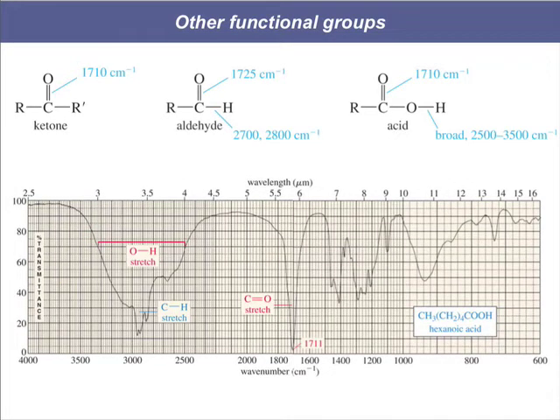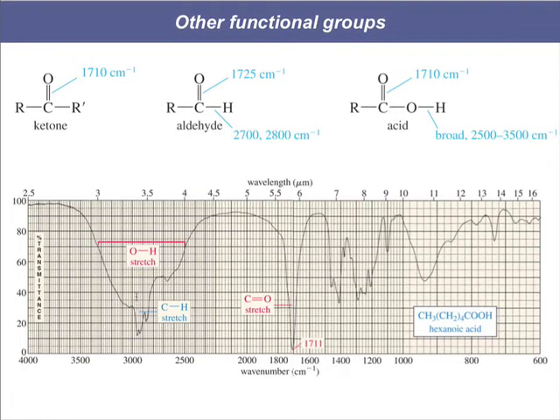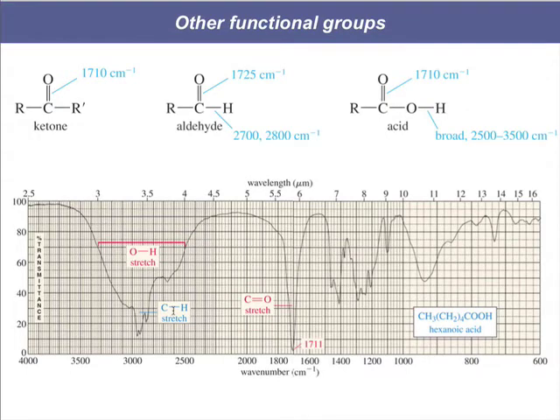More functional groups. Here's a carboxylic acid. This is hexanoic acid, so we should see our normal hexane vibrations. Notice that the OH stretch, the acid OH stretch, is so broad, from 2500 ranging all the way up to 3500, centered around 3000. Notice that almost blocks out our CH stretch altogether. So that's another buyer beware, a caveat that sometimes these signals will occlude other signals.